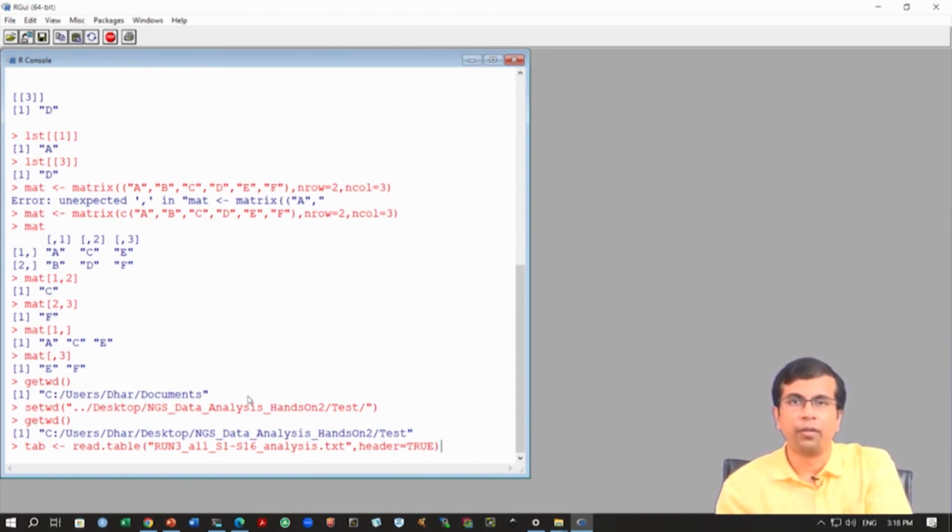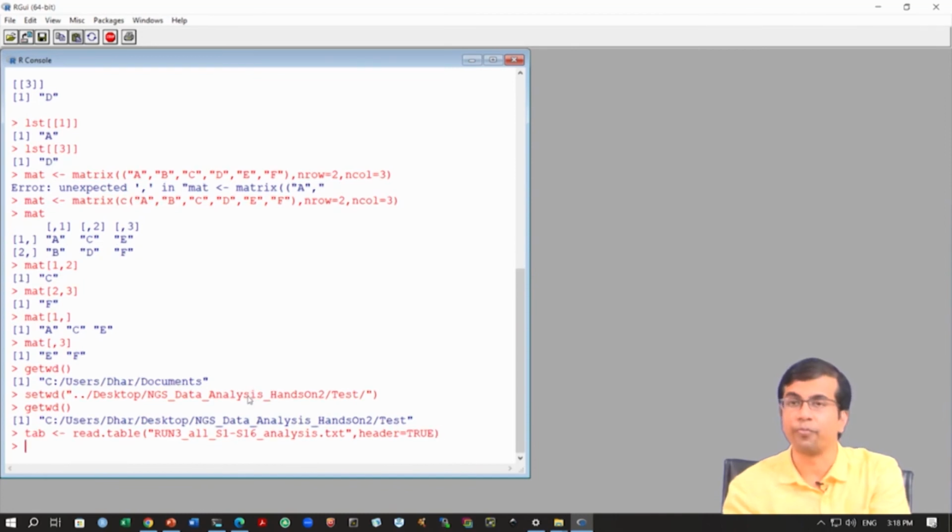I showed you we have these S1, S5, S9 etc. names in the first line. That is the header line, which is why I mention header equals TRUE. This is what we get now, and we can simply type tab.